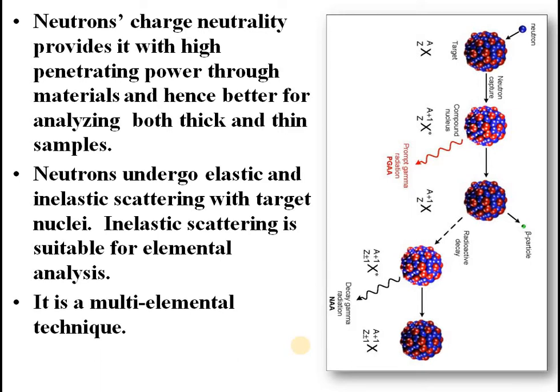Another important feature is that it is a multi-elemental technique, in the sense that it can be used to identify many elements at a time. Your sample may contain many elements of your interest, and all those elements can be simultaneously analyzed.